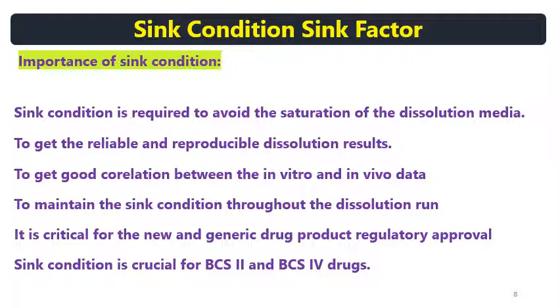Maintaining the sink condition throughout the dissolution run is very important. Then only you can get a good dissolution profile. It is critical for new and generic drug products for regulatory approval purposes. Sink condition is most crucial and critical for BCS class 2 and 4 APIs.